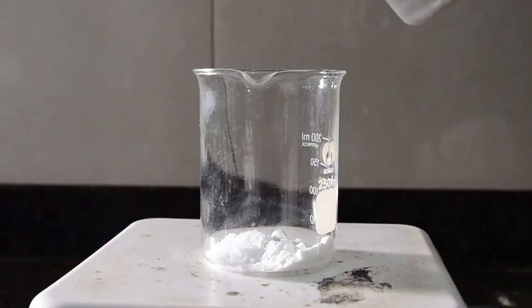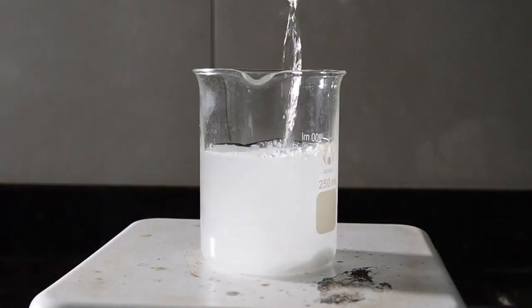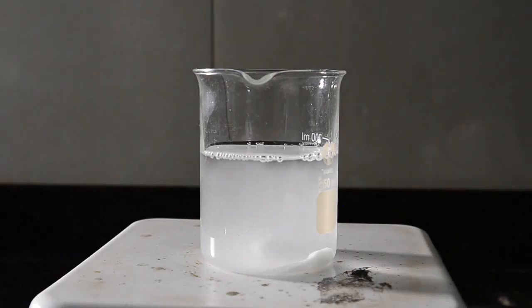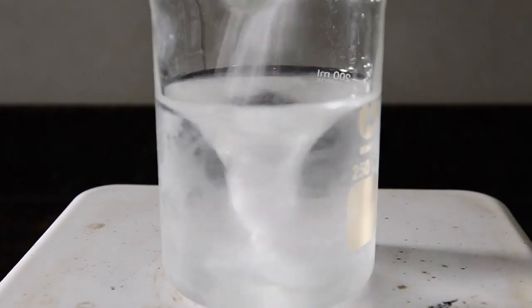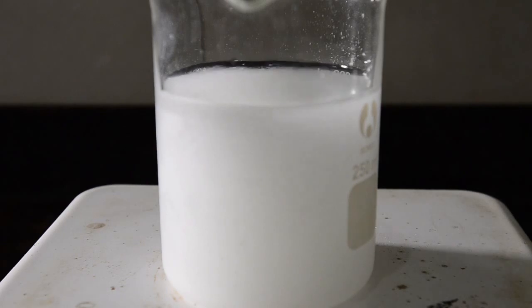First, we place a magnetic stir bar in the beaker containing the potassium iodide and bicarbonate and add 200 ml of water, then stir to dissolve. Now add the vanillin to the well-stirred solution. This won't dissolve, but it will form a suspension in the liquid.